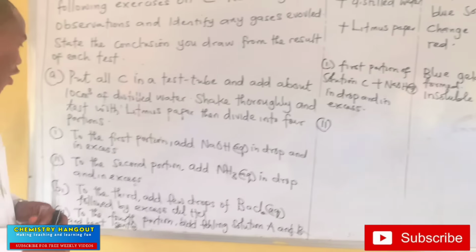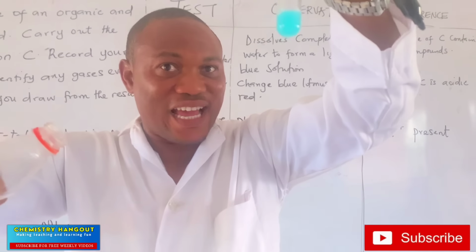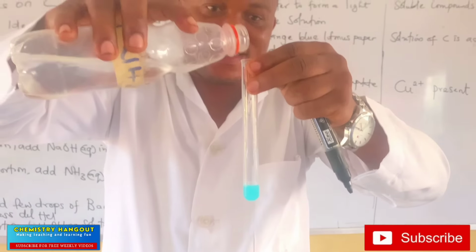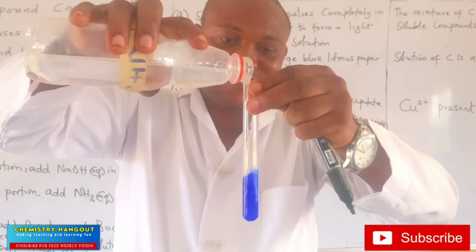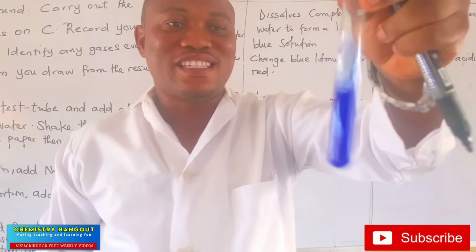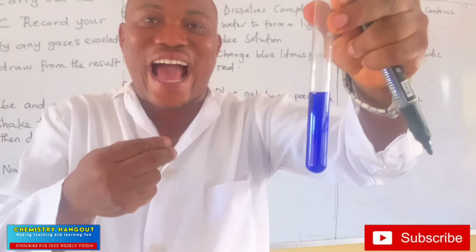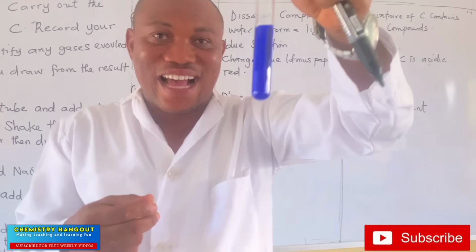Did you see that now? I'm not seeing any precipitate here. So in excess now, let's go in excess and see. Can you see everything dissolved? That's why it's a practical exam.